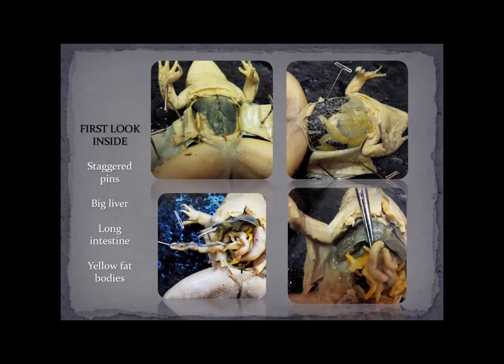First look inside: this is what it's going to look like when you open up your frog and pin it down — here is the skin, and this is the muscle layer. When you first open your frog, assuming it's not a female with a bunch of eggs — if it is, you could see a huge mass of eggs, which makes it very difficult to dissect anything underneath. A suggestion is to pick those eggs out with your fingers at the sink to get rid of them so you can see the other structures. The largest internal organ, which has multiple lobes, is the liver — it's one organ.